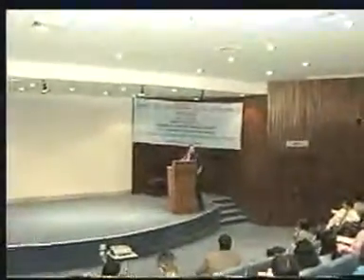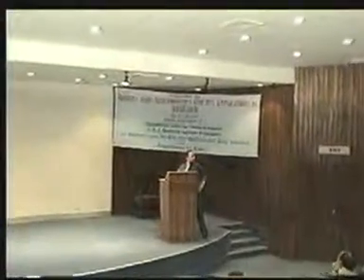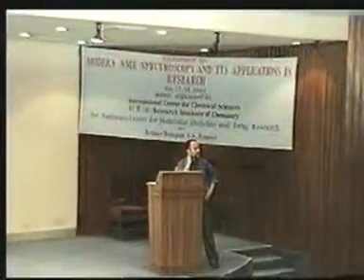You got my question? Yes, I heard the question, and I say yes. It's possible to apply the same solvent suppression techniques that we use in LC-NMR. It's possible to apply them in standard NMR. From the NMR point of view, LC-NMR is just NMR.